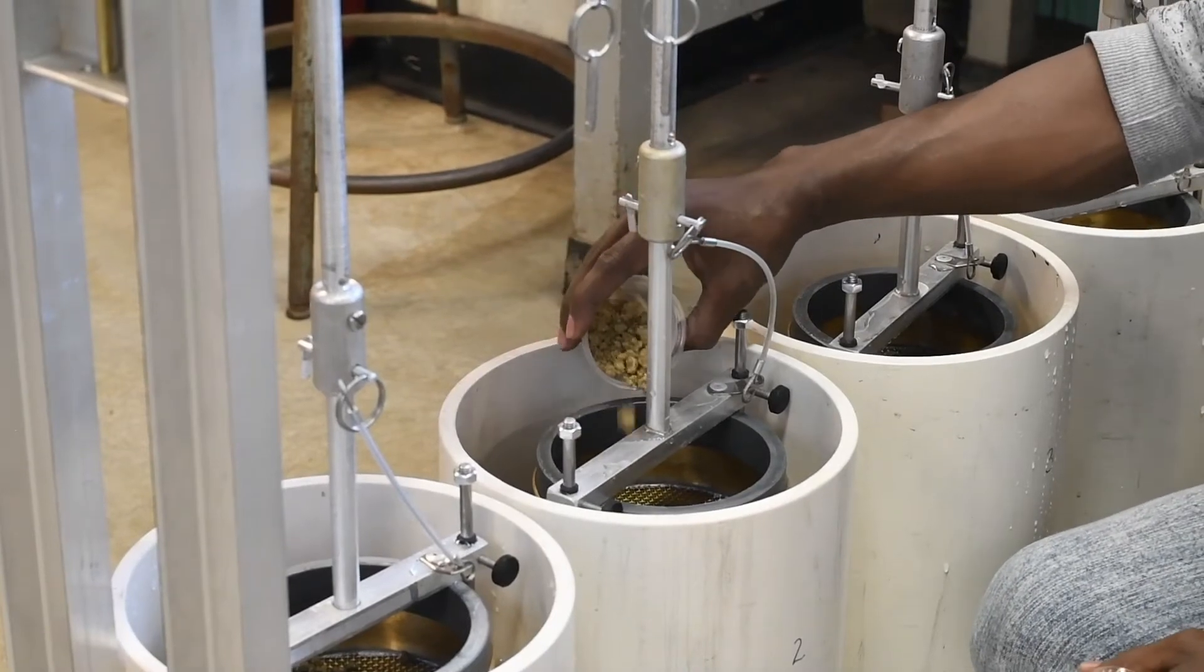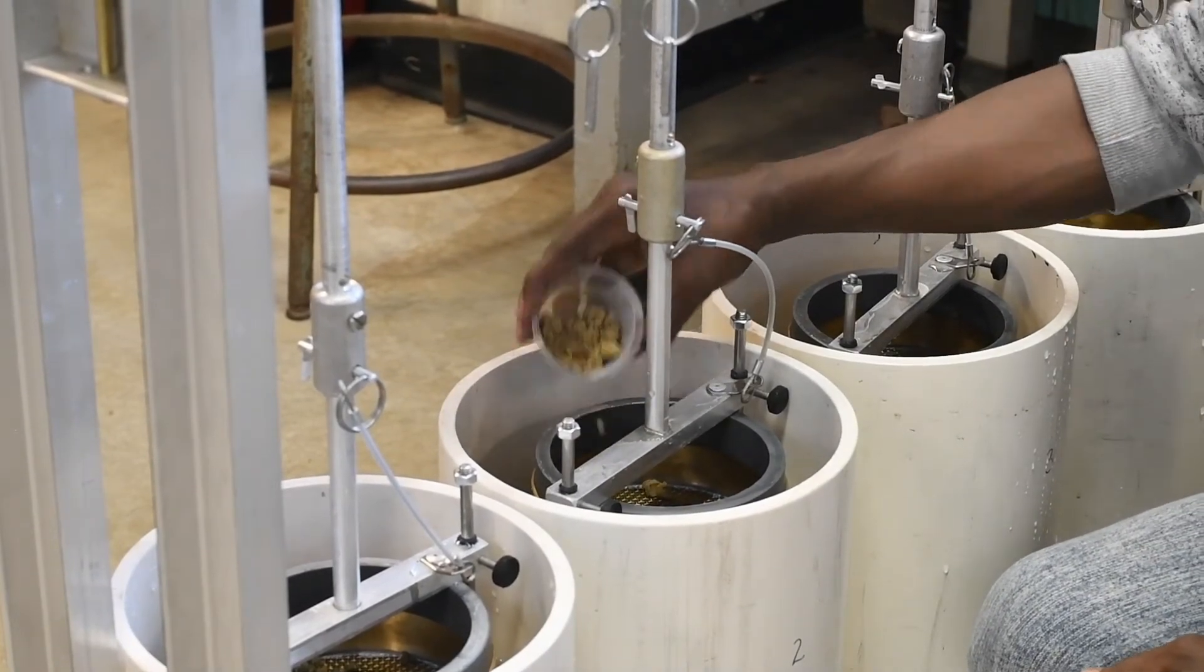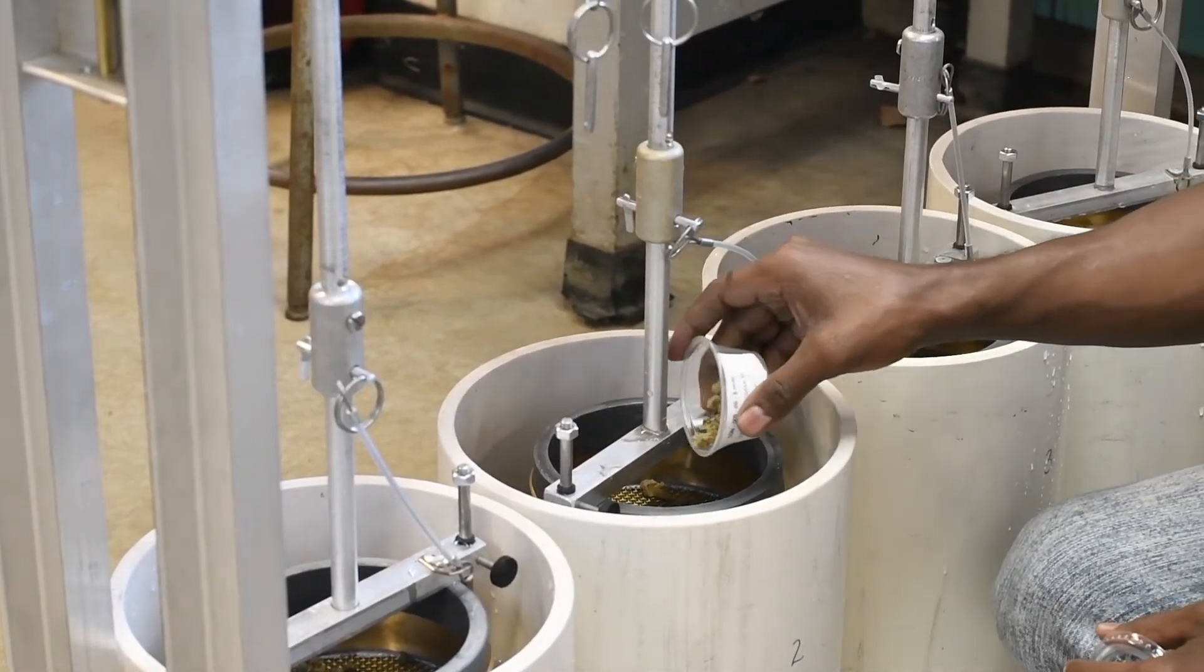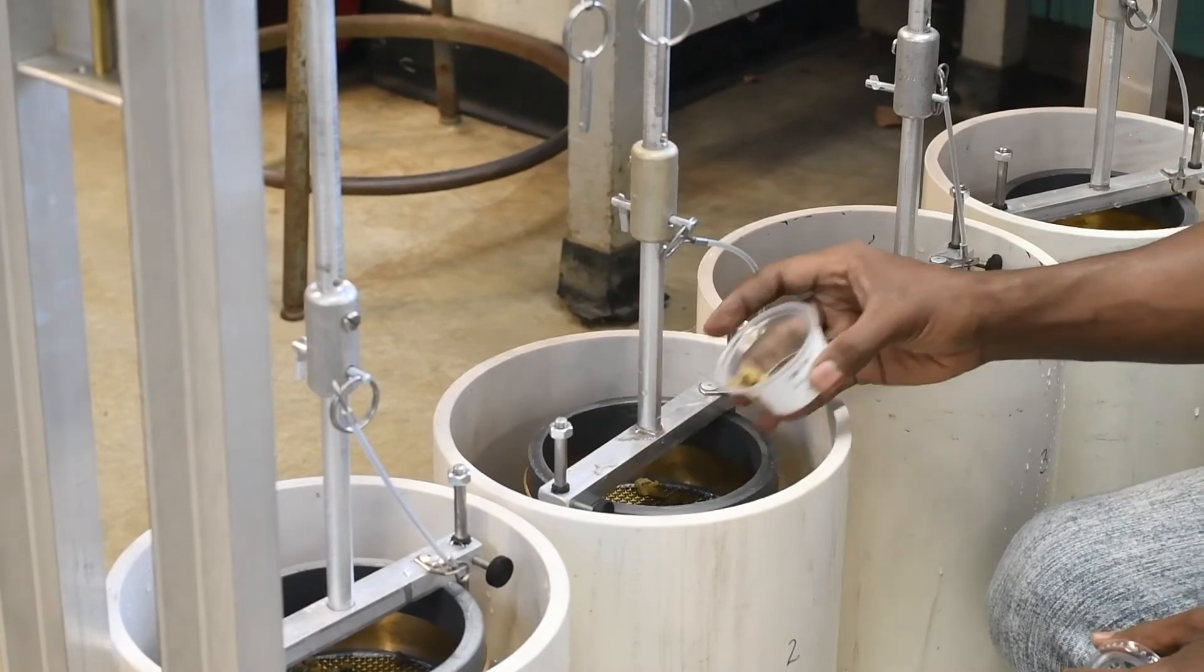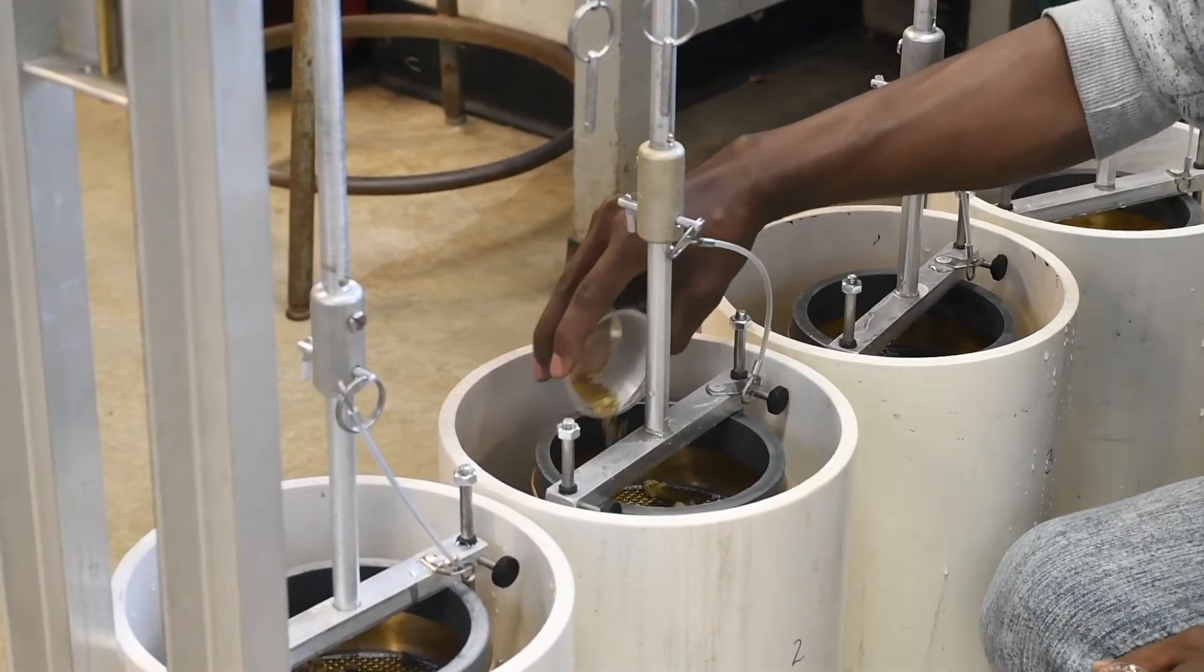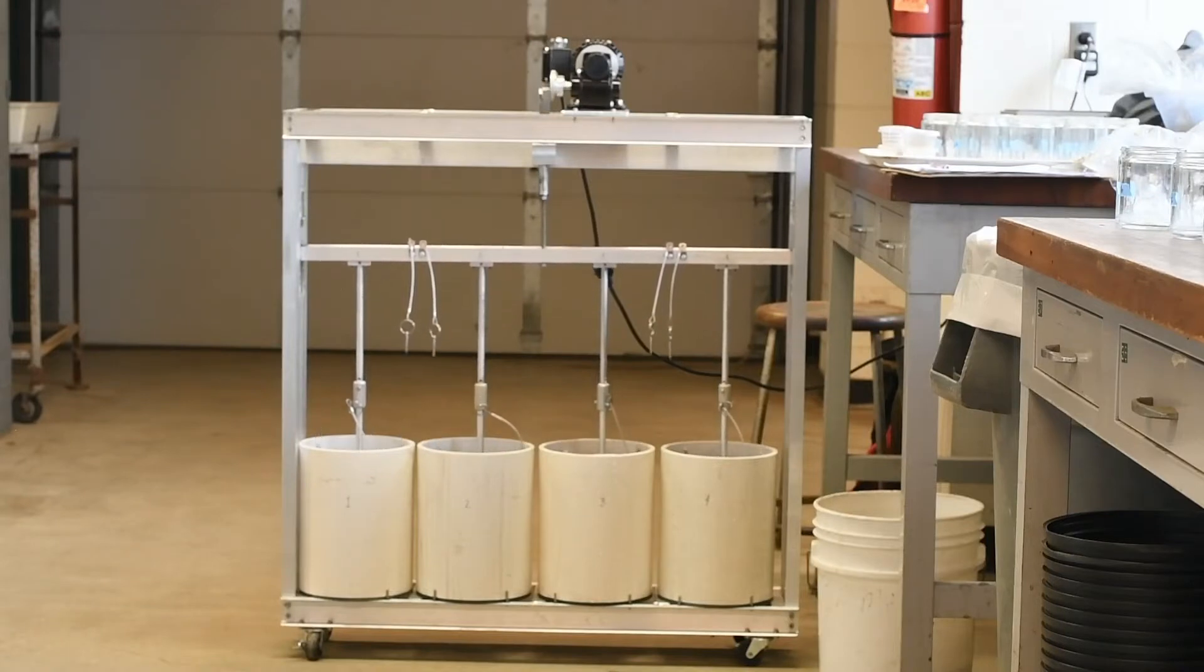When you are ready to run a set of samples, return the device to its highest position. Gently distribute 25 grams of sample across the surface of the top sieve. Hit the switch to start the device and set a timer for five minutes. This time may differ depending on your protocol.